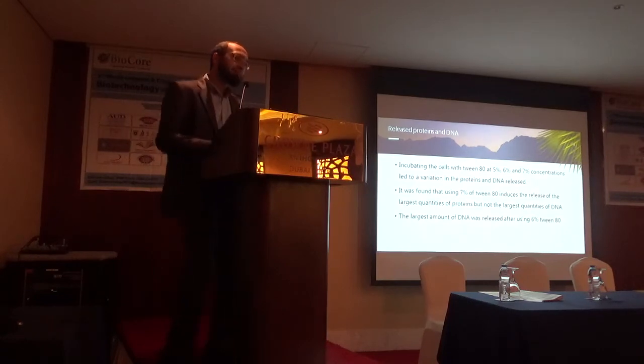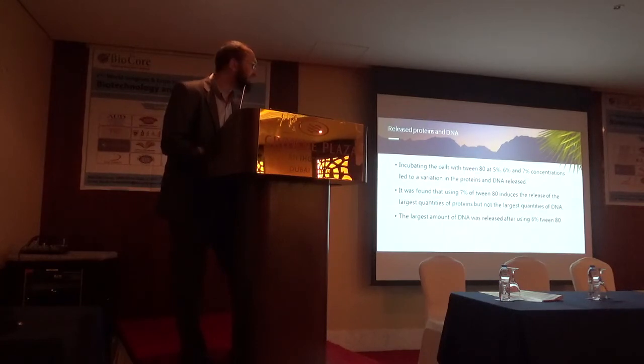After that, we also have to quantify the quantities of proteins and DNA in order to confirm the evacuation of cells. Incubation of cells with Tween 80 at 5%, 6%, and 7% concentrations led to variation in proteins and DNA released. We noticed that the highest quantities of proteins were released at 7%. The highest quantities of DNA were released at 6% Tween.